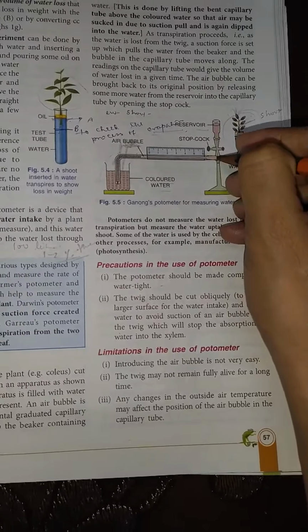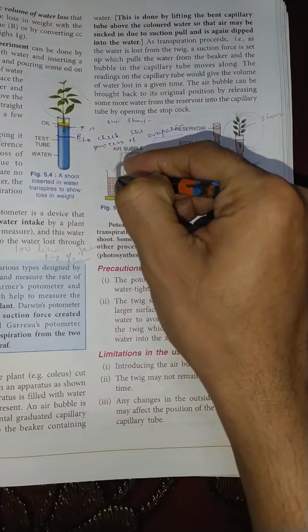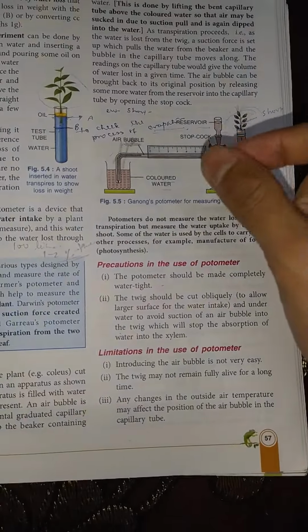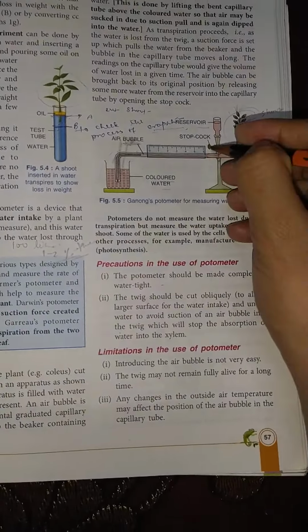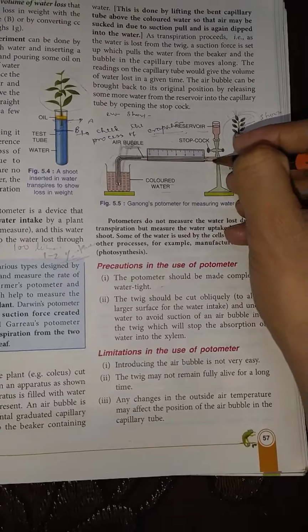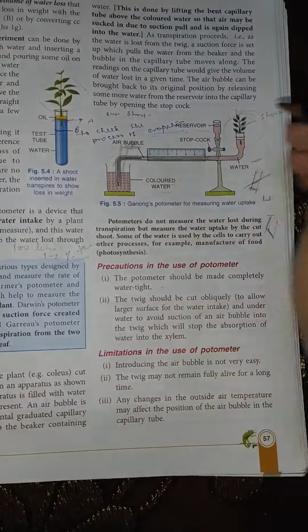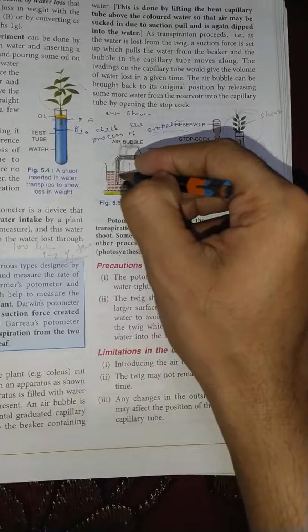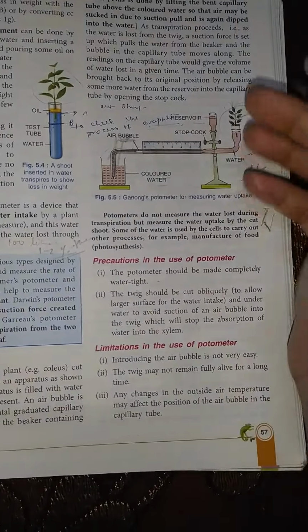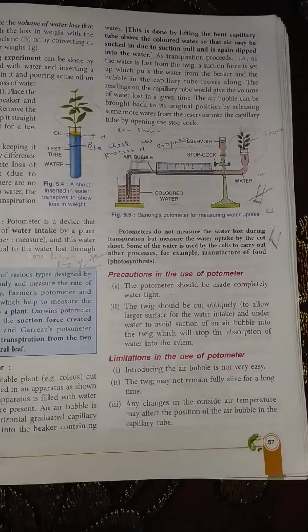So if the water is coming from this side, this will push the air bubble downside. So very slowly, just drop wise, you will add the water of the reservoir into the capillary tube, and the air bubble will move very slowly. जैसे सपोज कर यहाँ पर जैसे आया वैसे ही स्टॉप कॉक तुम बंद कर दिए. So now you will be able to again start the experiment.